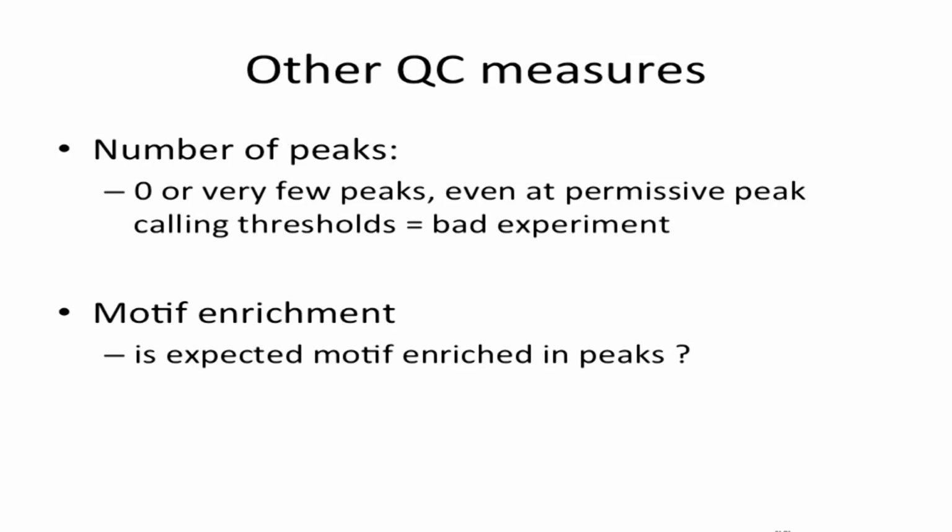For most transcription factors, you do expect very sharp peaks in the genome. For histone modifications, the story can be a bit more complex. You have histone modifications from domains with not a huge amount of enrichment, but even so, they should usually form peaks, especially at promoters. Motif enrichment is also very, very, yes?